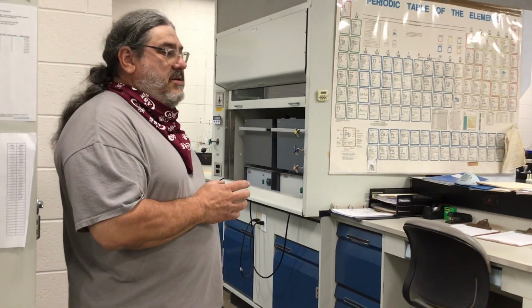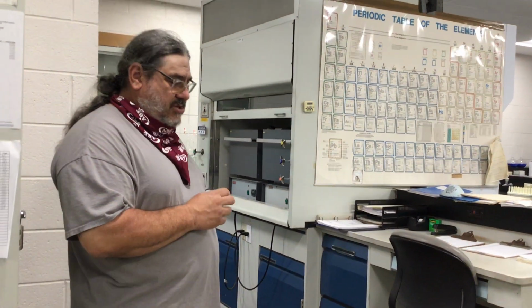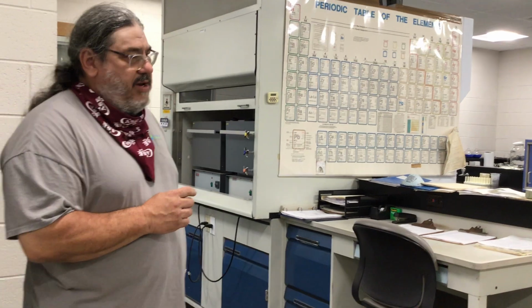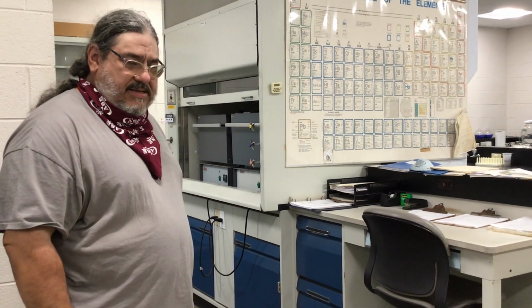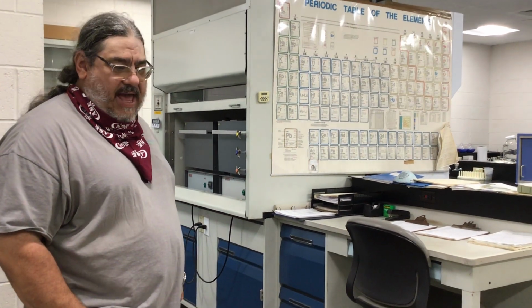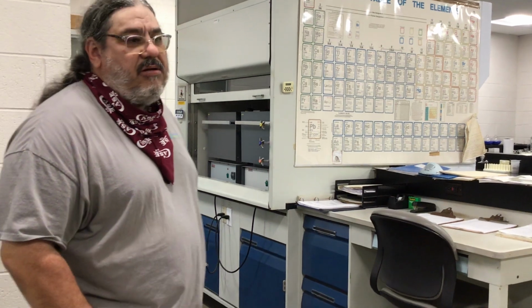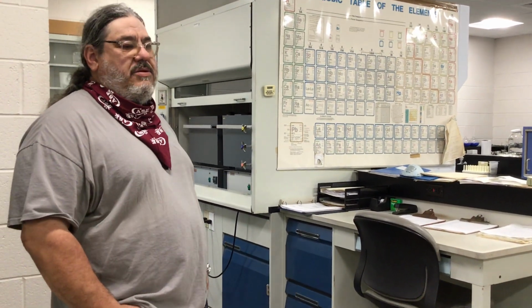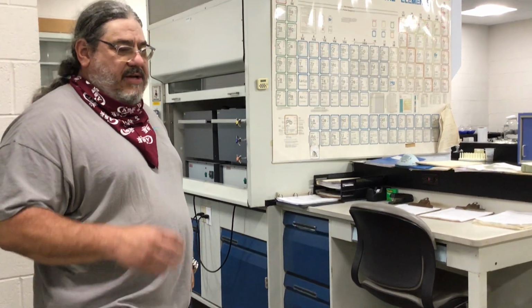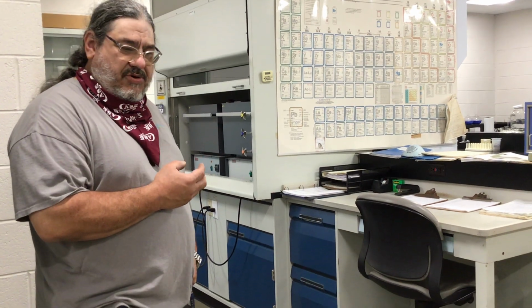And the last is the industrial testing. The plant that we just toured is designed to treat domestic sewage. It can take some industrial wastewater for treatment, but it has to meet certain requirements. One of the big things is toxicity. In our case, toxicity from heavy metals, things like cadmium, chromium, lead, nickel, zinc. We have limits, which are called local limits, that we develop here at the treatment plant for those parameters. And we do that because they're tailored specifically to our treatment process.